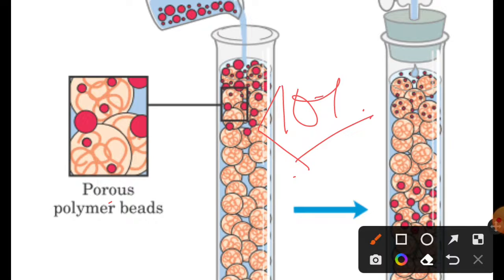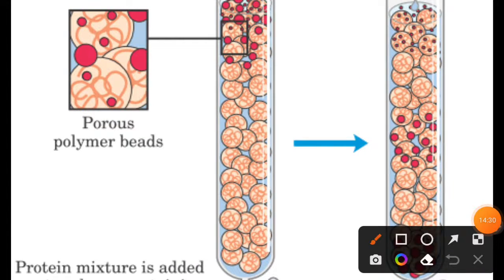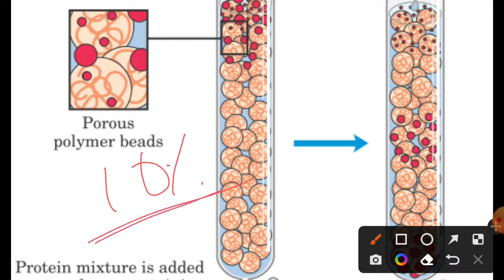And another important disadvantage of size exclusion chromatography that I need to mention is that it is low resolution chromatography, okay. So the advantage is that it provides you a good separation within a small time that our column chromatography cannot provide, okay, and the disadvantage is it requires at least 10% difference in molecular mass for separation, otherwise it cannot separate.